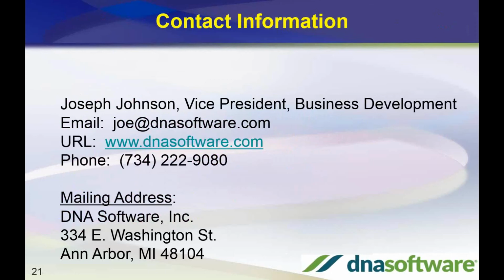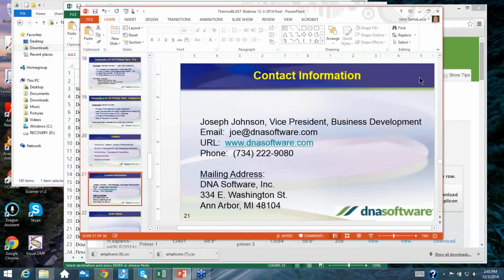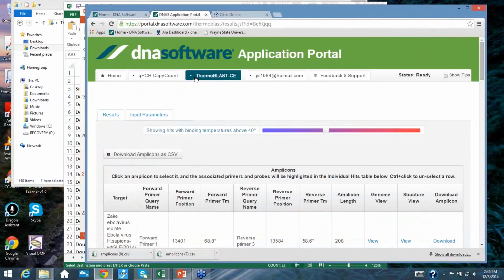The next question is, the default playlist appears to be DNA. How does one enter an RNA playlist? Oh, that's very simple. When we're choosing the sequences, if you give them as GenBank accession numbers, it automatically assigns the sequence type based on whatever the GenBank record is set to. But you can change it. That's in the software there. It's probably not so easy for me to get to it from here, but it's very simple to set that. Let's see if I can find it quickly for you.